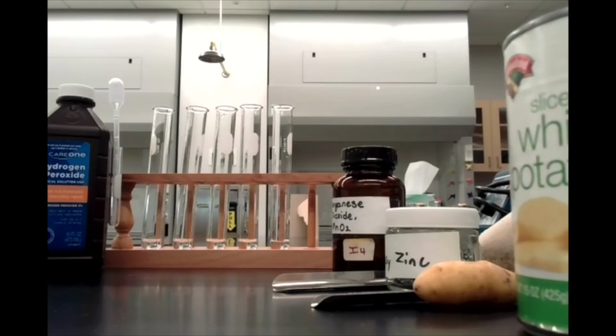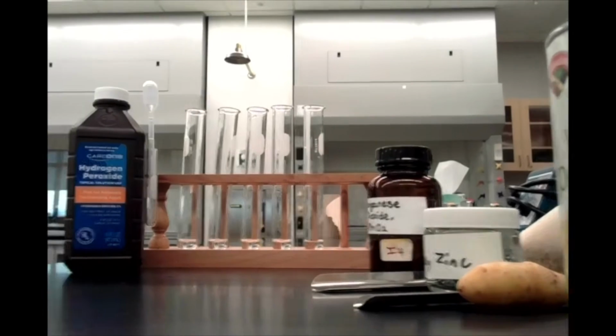So up here you can see I've got 5 test tubes. I've already added 2 milliliters of hydrogen peroxide to each of them. If you want a little bit of a close-up look over there, there's our 5 test tubes, and it's kind of hard to see any bubbles forming. I'll see if I can get you a closer look later on once we get these reactions started.